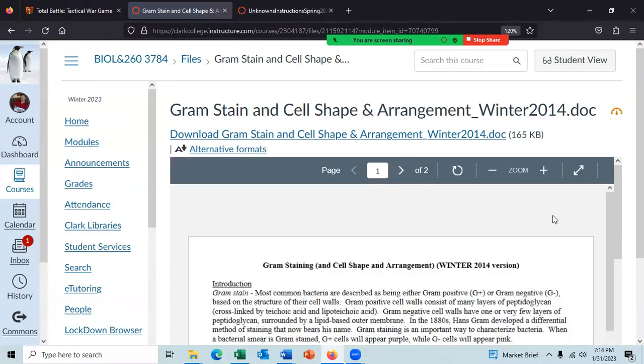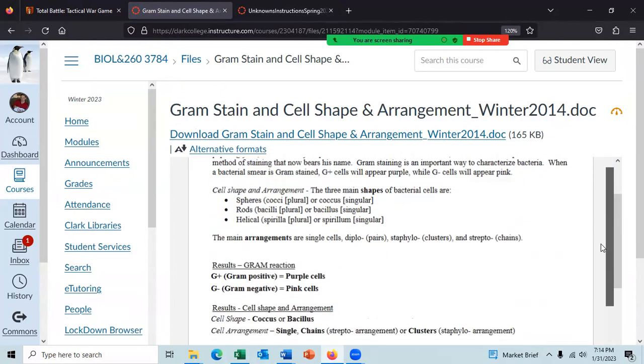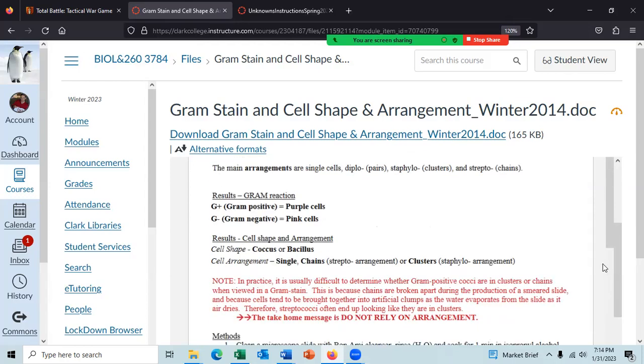With the shape of the gram stain, the 3 main shapes are possible. The main arrangements are diplo, staphylo, strepto, and where is it saying here? It is difficult to determine if cocci are in clusters or chains when viewed under the gram stain.